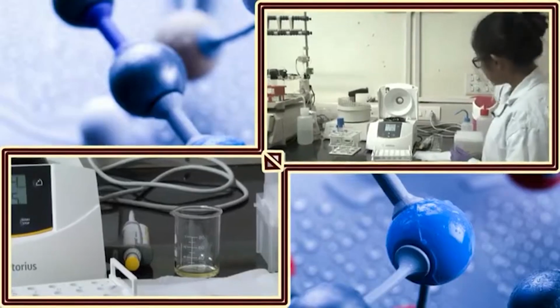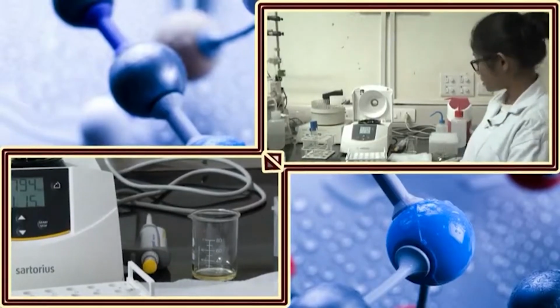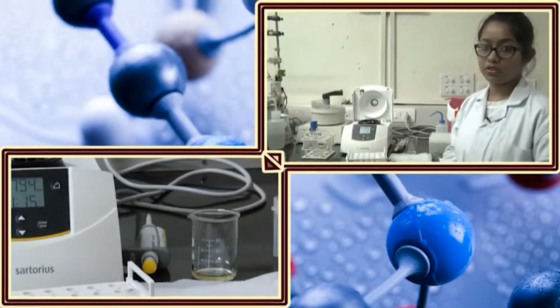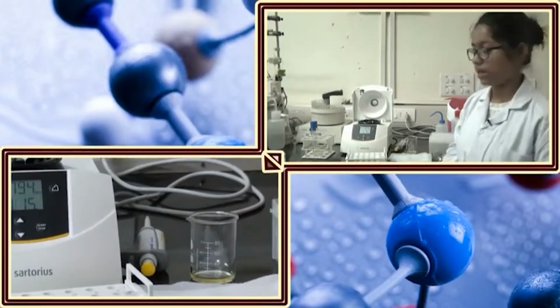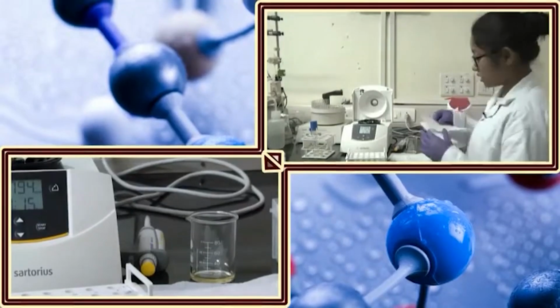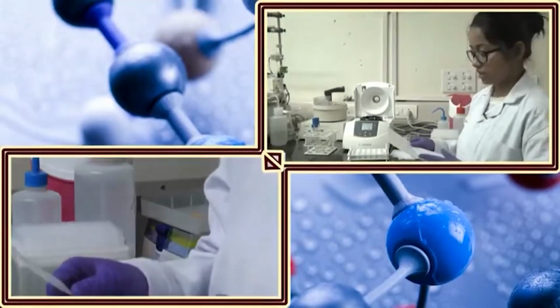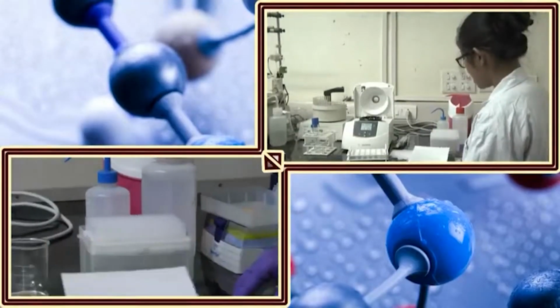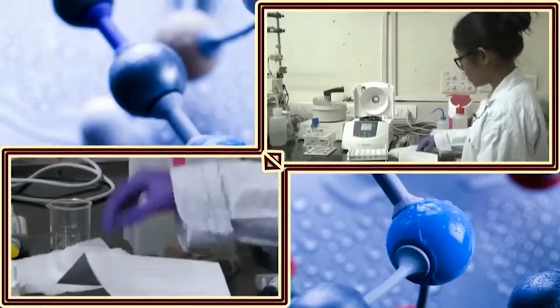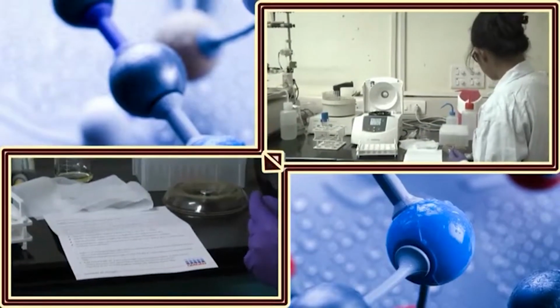There are different types of purification method. In this case, we will be doing the alkaline lysis method. As I have mentioned earlier, I will be using a mini prep kit, but you can make this kind of solution in your lab as well, following any molecular biology protocol book. The steps which we have to follow will be given by the prep kit manufacturer. Also, it is a similar protocol, you can get it online or follow any book. So, there are 3 types of solution.